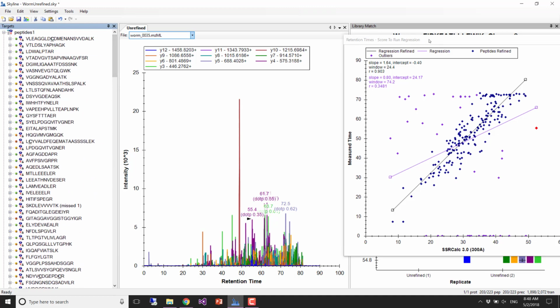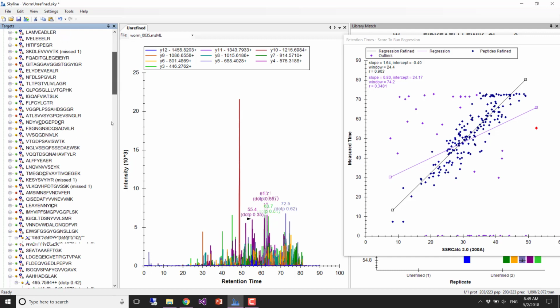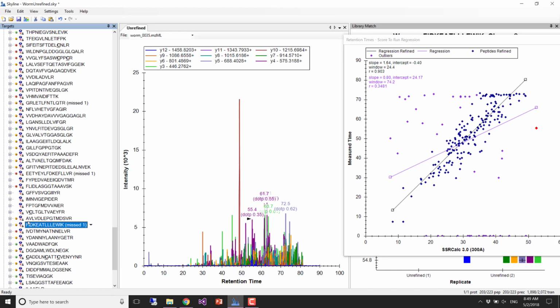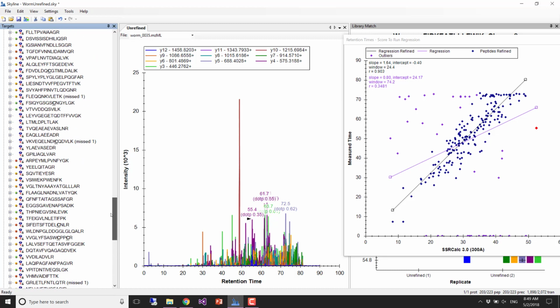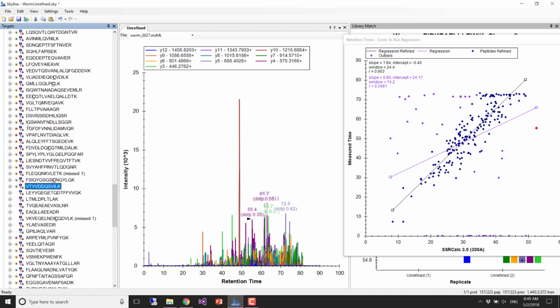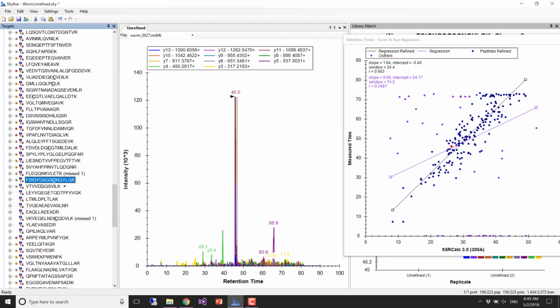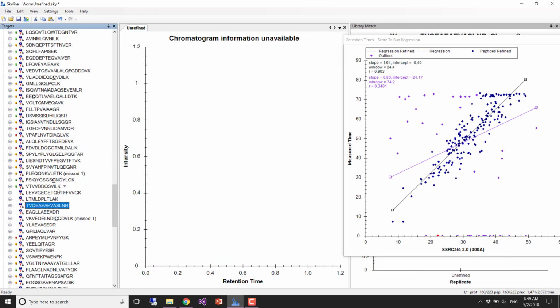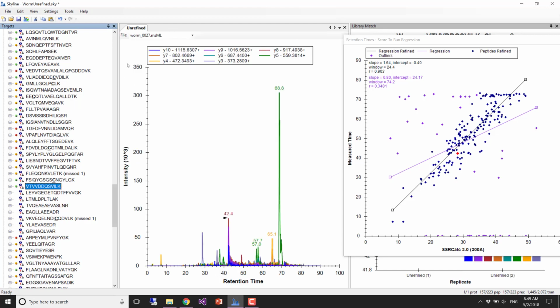Okay, so how did I get this? Well, to get the file numbers, you have to select a peptide. So if you look at the first missing swatch and you select the peptides above, then you'll get file. If you select the empty peptides, you won't even get a graph. You didn't get that? She wasn't on the right peptide. I don't know whether.